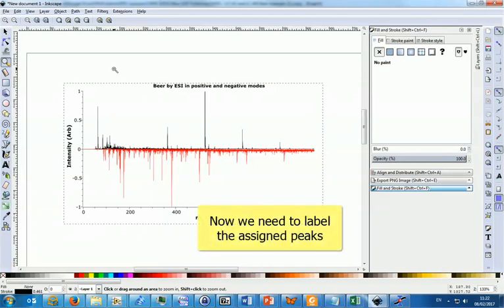If you were submitting a spectrum like this to a journal, you'd need to label the peaks you were going to discuss in the text. So for this lab I want you to label the peaks you've managed to assign in the two spectra you can see displayed.